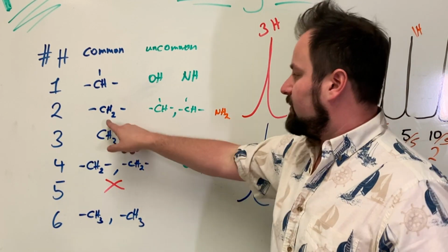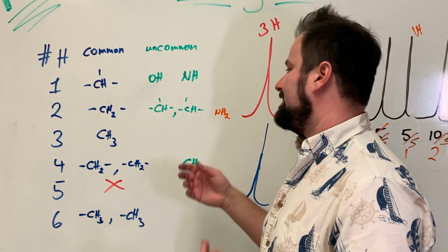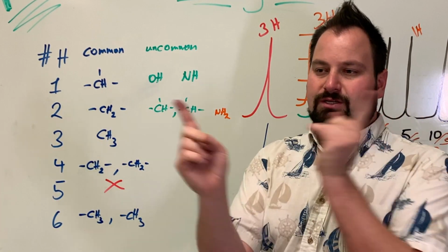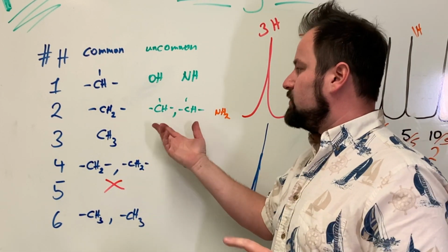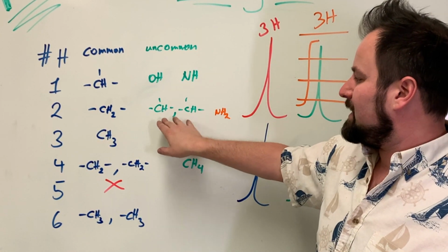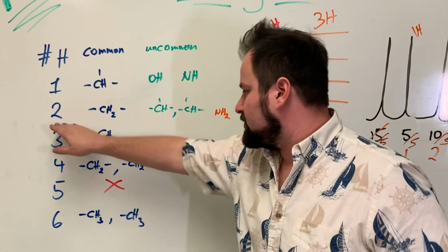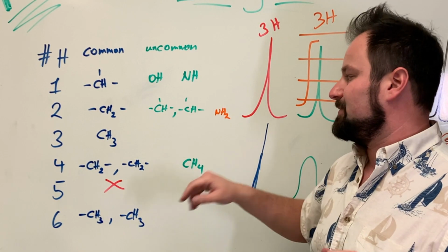And so for these two, obviously these two are identical. They can spin, they're interchangeable. You can't tell them apart. However, if you have 2 symmetric CH's on 2 opposite sides of the molecule, if they can be interchanged that way from the whole molecule spinning rather than the individual bond, those do show up as well. So be aware if you see 2, it could technically be 2 CH's. Now, 2 H, if it is integrated 2, it could be 2 separate CH's.